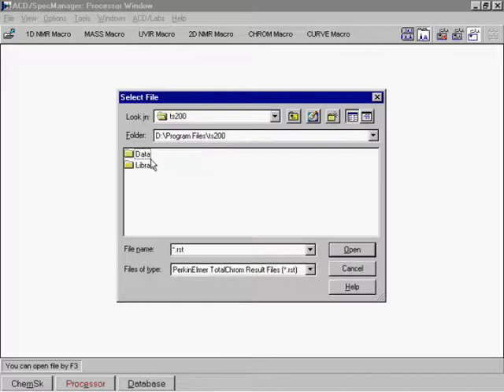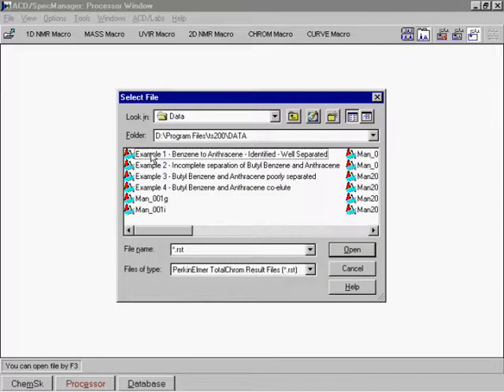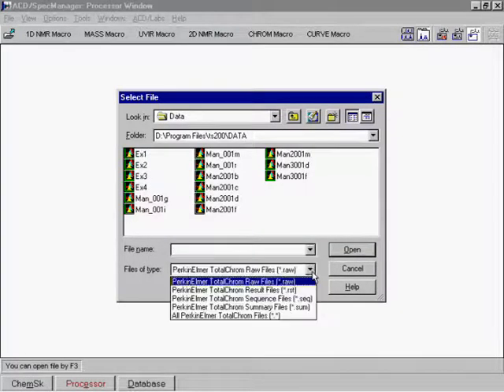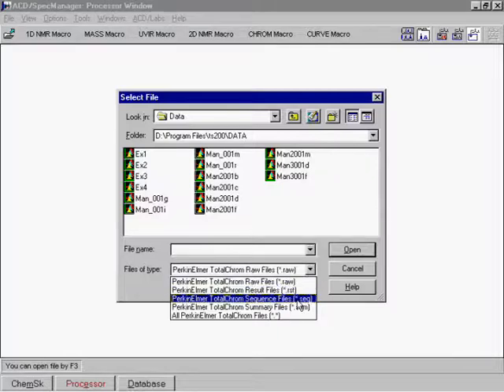Select the file to be imported. It can be a Perkin Elmer raw, result, sequence, or summary file.